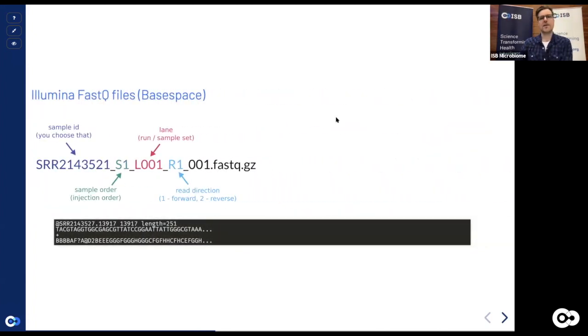So let's maybe talk a little bit about what that sequencing data actually looks like when you get it. Let's say you sampled something from a super interesting environment, for instance, the honeybee gut. You had your honeybee gut microbiome samples, you extract the DNA, you pass them to the sequencing unit. What you will get is something like that.